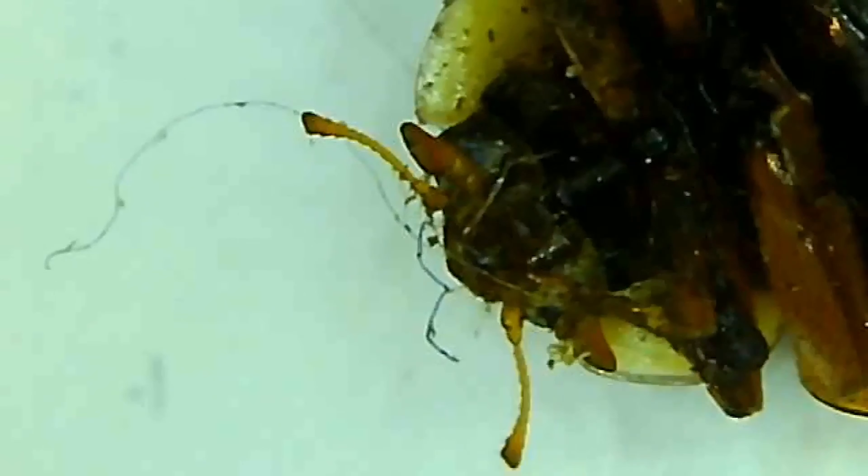We did look at some bees. We did get some body shots and head shots. We did look at some ladybugs. It was actually pretty cool to see the little details on the hairs, the pollens and stuff like that. It's that time of the year when the bees are out and they're gathering for winter, so it was pretty cool to see all the details on them.